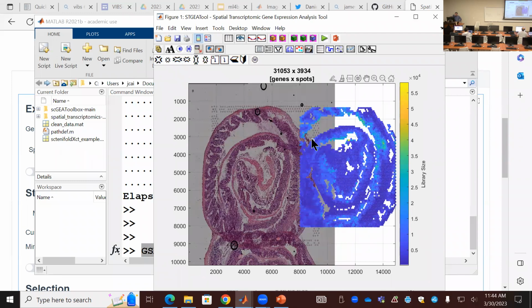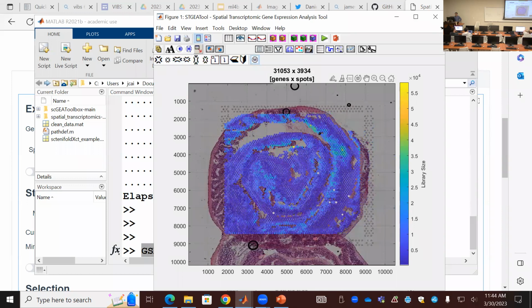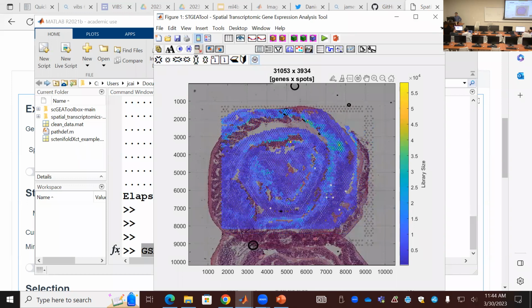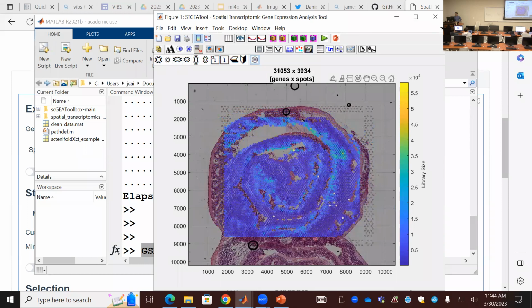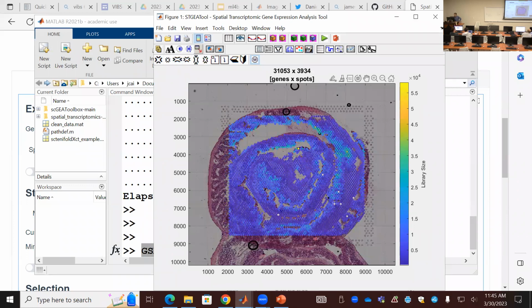So I did some rotation and then flip image, mirror flip. And then move to here. It should also look at those spaces. That's the one. Yeah, I believe this is a correct alignment. Not perfect, but the ballpark should be something like that.